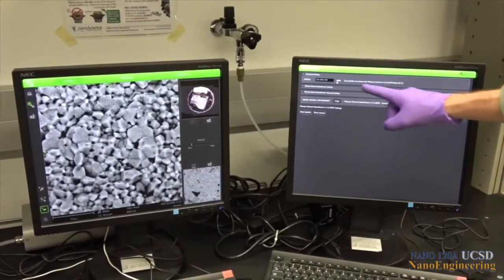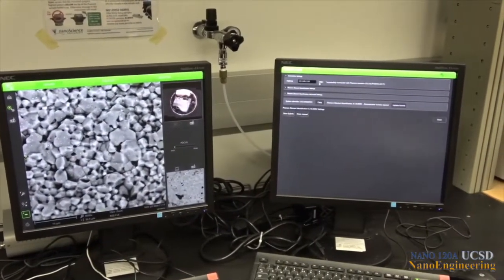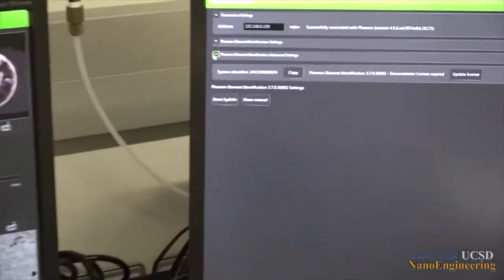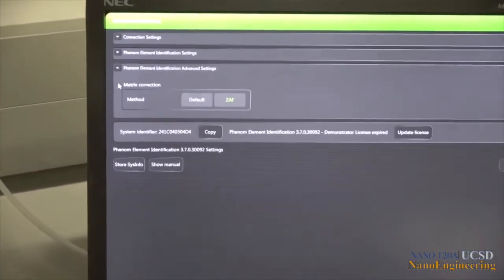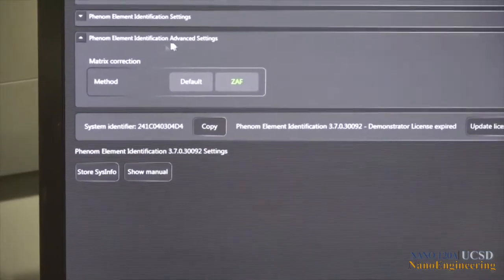In addition, make sure that the ZAF icon is lit in the Phenom Elemental Identification Settings menu. This is a correction routine that's applied to assist in accurate quantitative elemental analysis.